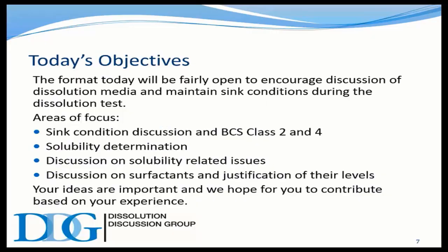So the objectives today, this is a fairly informal discussion group, and what we do is we focus on some certain areas. For instance, today we're going to look at sink conditions, and this is based primarily on what we have to deal with Class 2 and 4 drugs, the poorly soluble drugs.